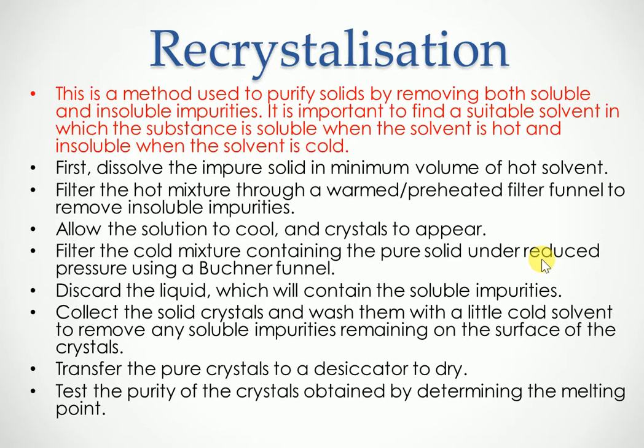Alright, in this video we're going to look at recrystallization. This is a method that is used to purify solids by removing both soluble and insoluble impurities. It requires a solvent in which the substance is soluble when the solvent is hot, and the substance is going to be insoluble when this solvent is cold. So the choice of solvent is really important in this technique.